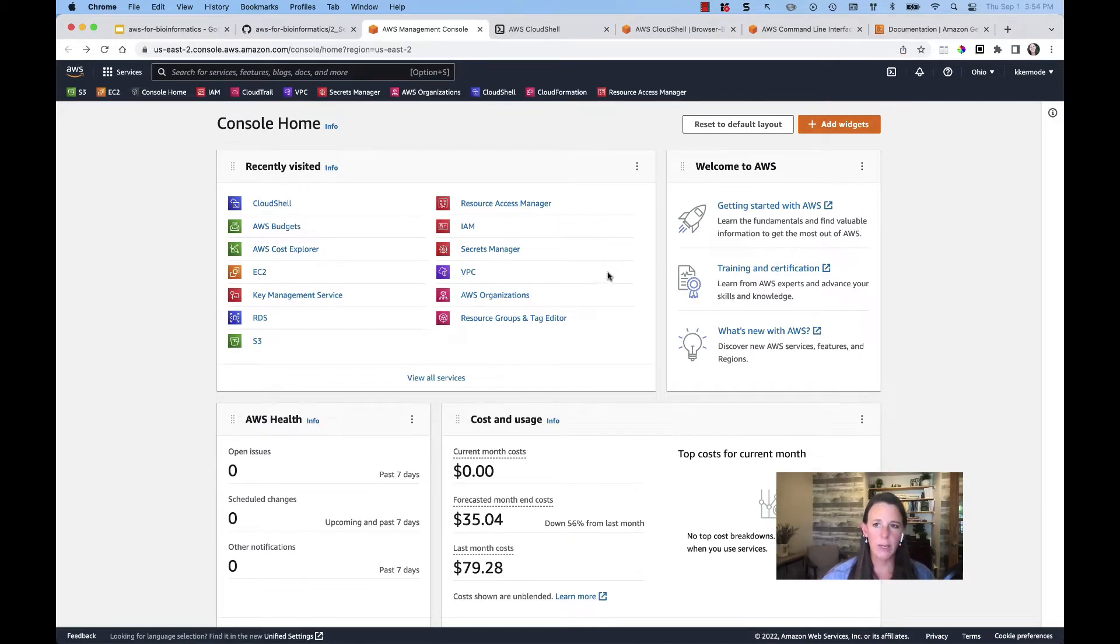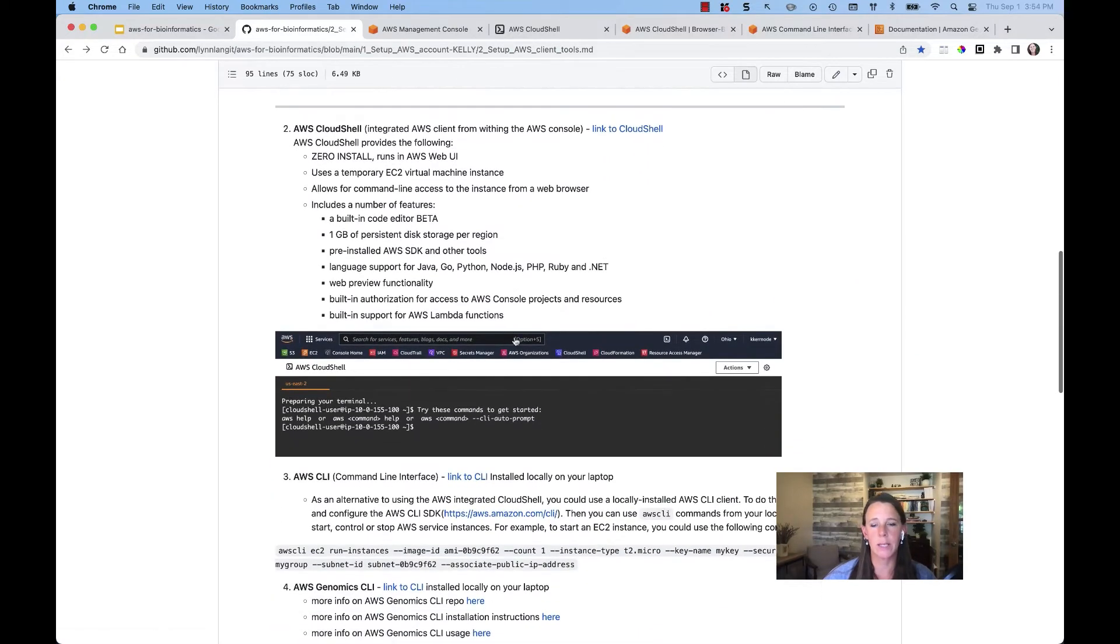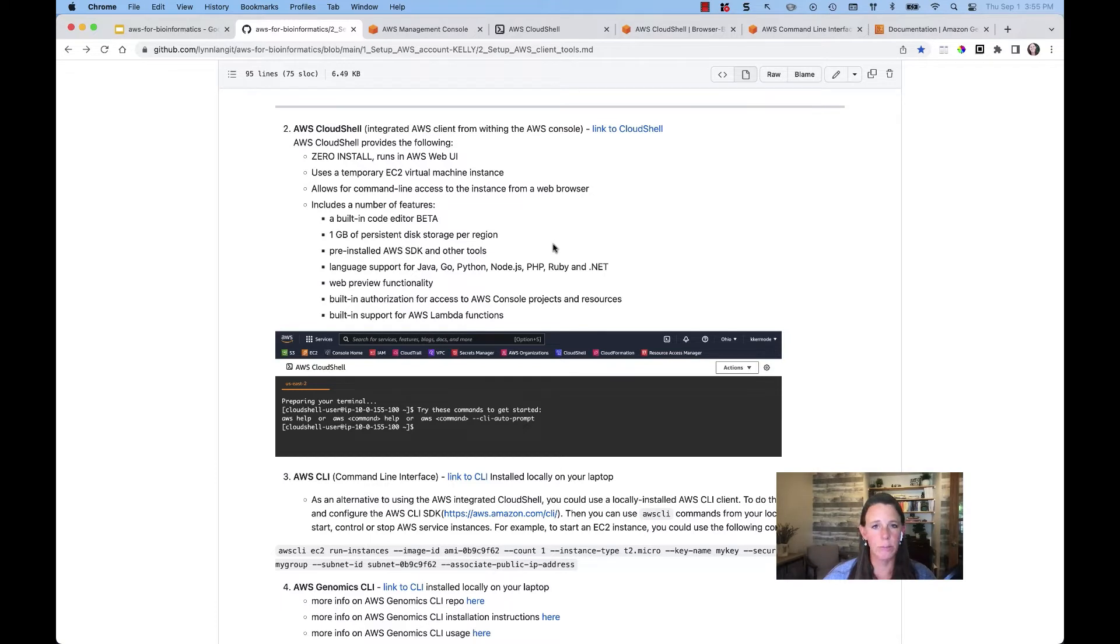Now, before we get there, let's just take a look at what exactly is Cloud Shell. Cloud Shell is going to be a temporary EC2 virtual machine instance that's going to be spun up for you within that browser window.